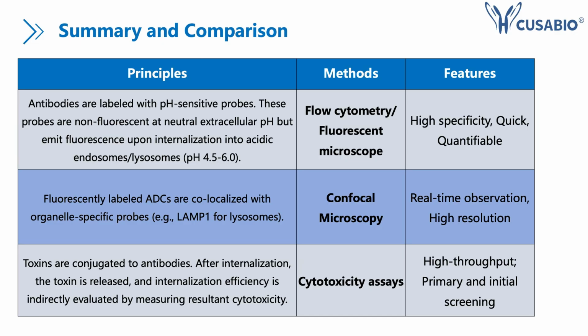This type of assay can be highly specific, quick, and the efficiency can be quantified. For the second one, you can do real-time observation with high resolution. You can directly see the co-localization of the ADC and the organelle-specific probes. But you probably need a confocal microscope and some compatible imaging software.